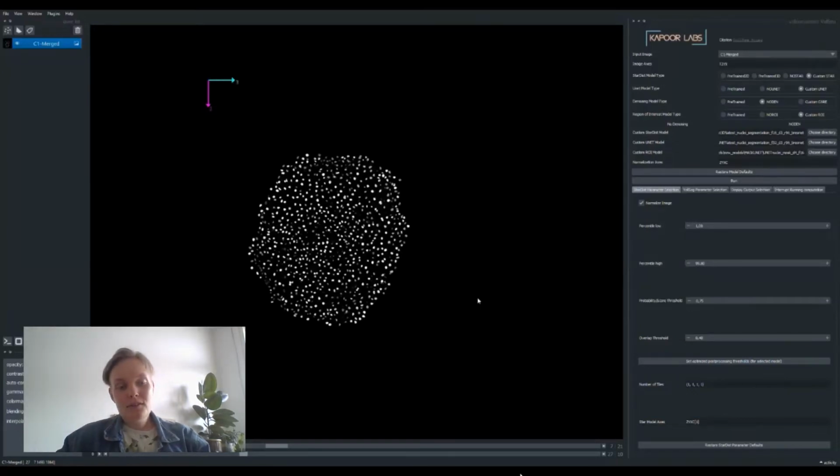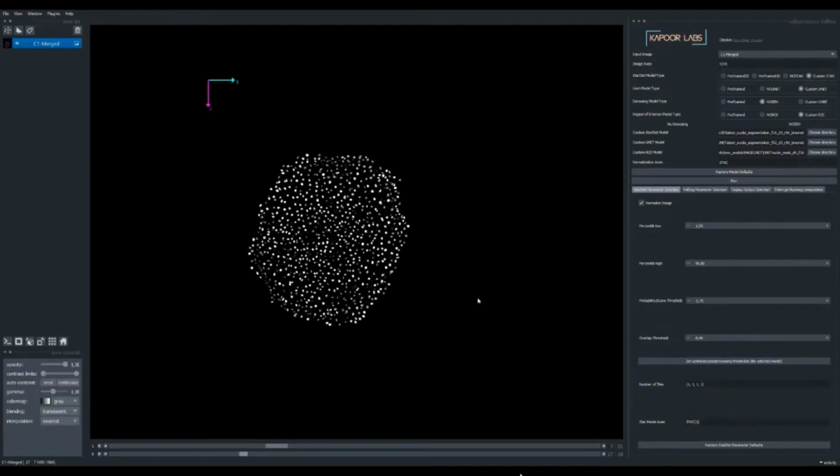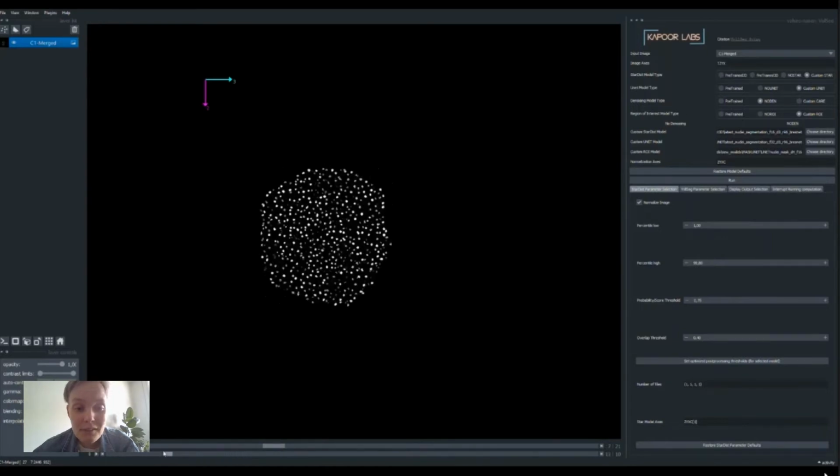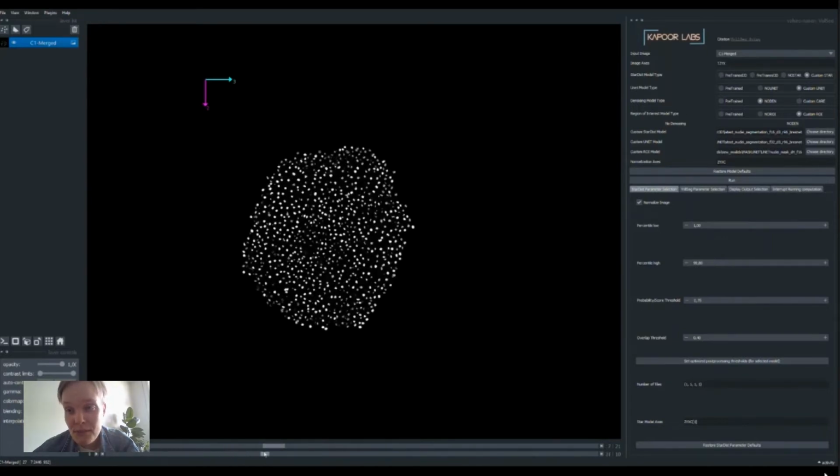Hello, everyone. So I'm just quickly gonna demonstrate some features of the VollSeg Napari plugin from an end user's point of view. So I have my raw data here. As you can see, it's 3D data and a time lapse of labeled nuclei that I eventually want to track. So first, I need to segment them.